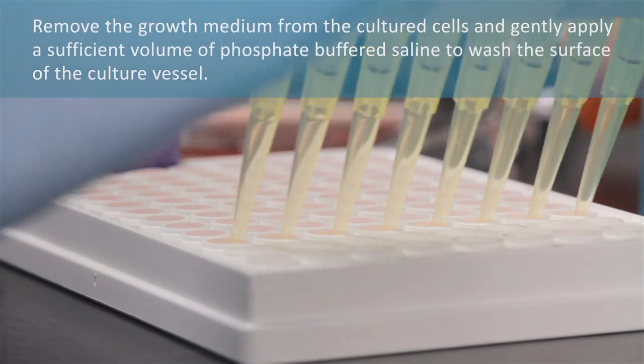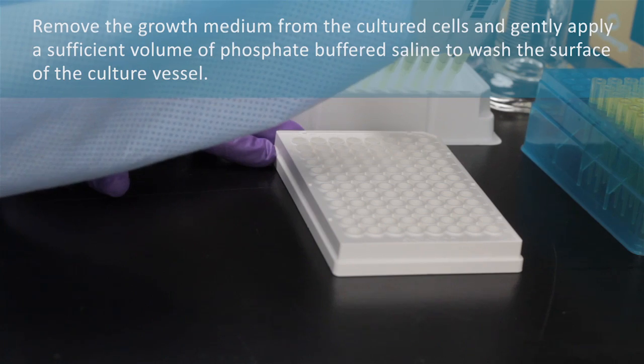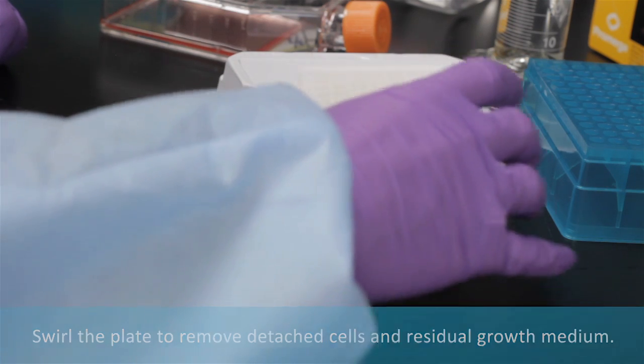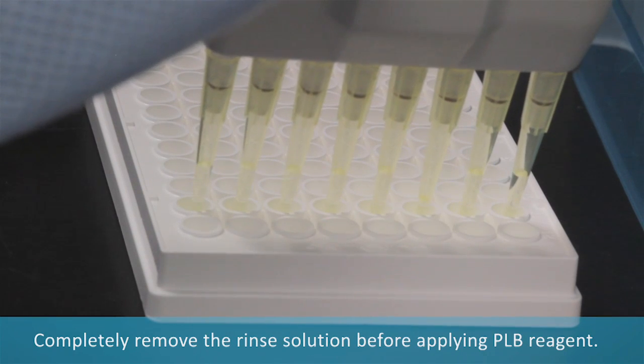Remove the growth medium from the cultured cells and gently apply a sufficient volume of phosphate buffered saline to wash the surface of the cultured vessel. Swirl the plate to remove detached cells and residual growth medium. Completely remove the rinse solution before applying passive lysis buffer reagent.